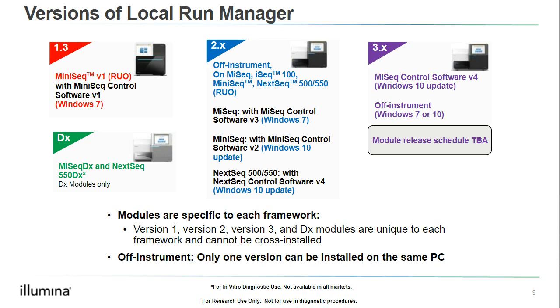Before you update your MiSeqs, we do ask that you communicate with your field representatives and fill out a pre-install checklist and let them know which particular workflows you normally use on your MiSeq. If the particular workflow as a module is not available yet, but will be available shortly, you may want to delay your update, but that's a conversation we recommend having with your FAS.